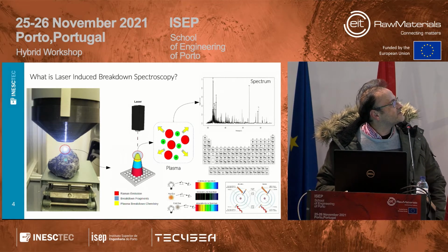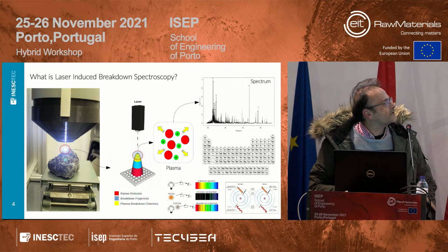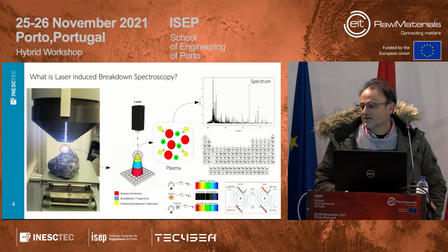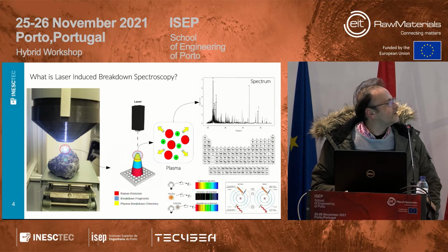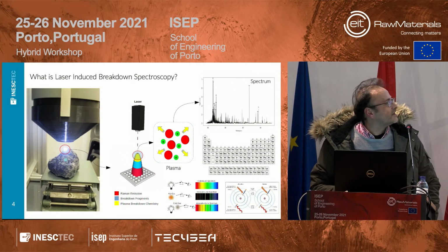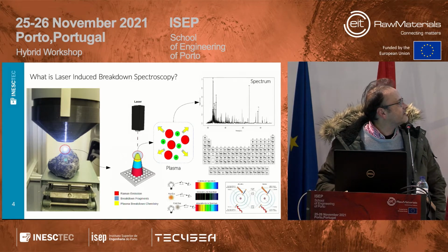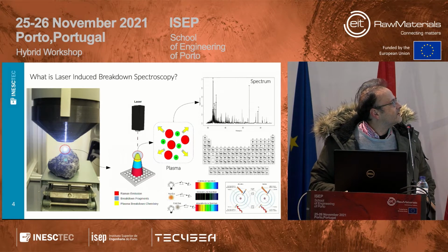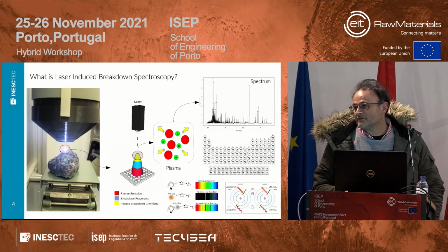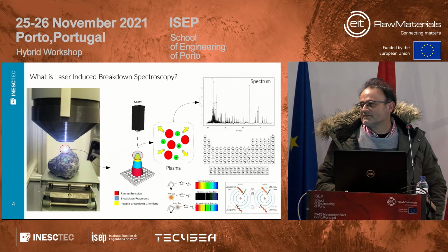The main issue is that when we use thermal energy to make ions, we first need to ablate the surface of the material, which might absorb or not, and therefore the efficiency of ablation is very dependent on the material. So it always begins there.